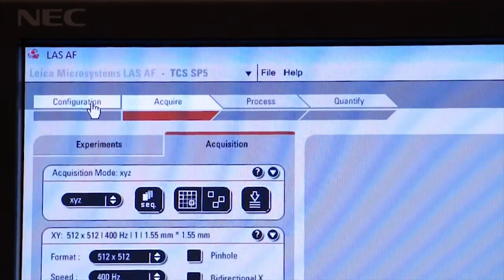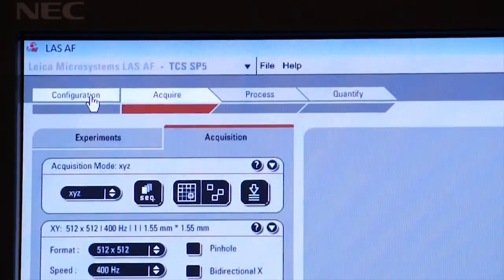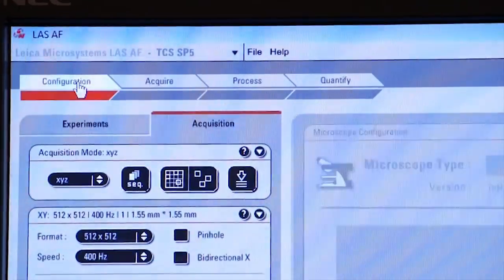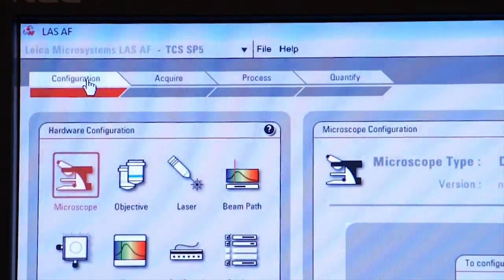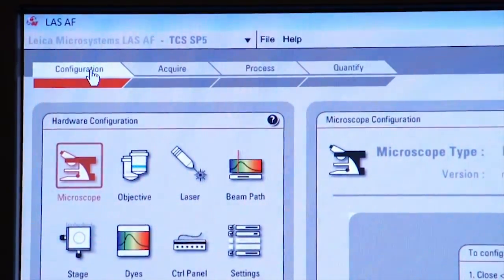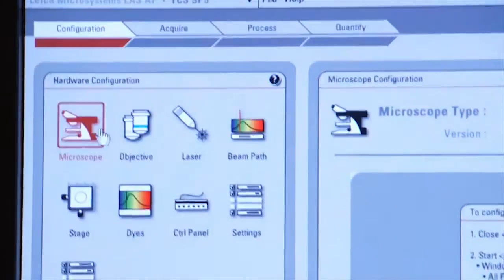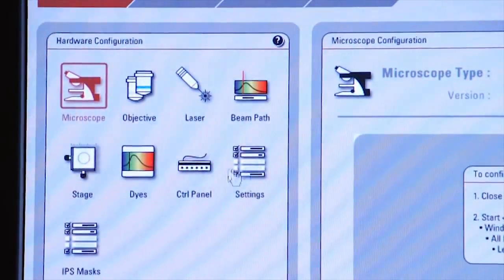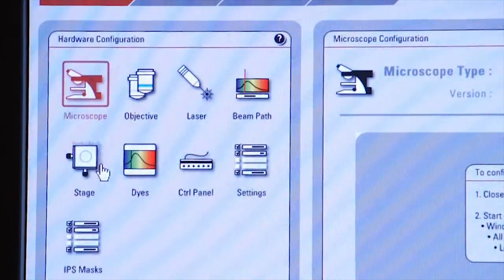Once the software is completely initialized, you go to the configuration tab and turn on the lasers. You'll see here a list of functions available to you for the microscope.